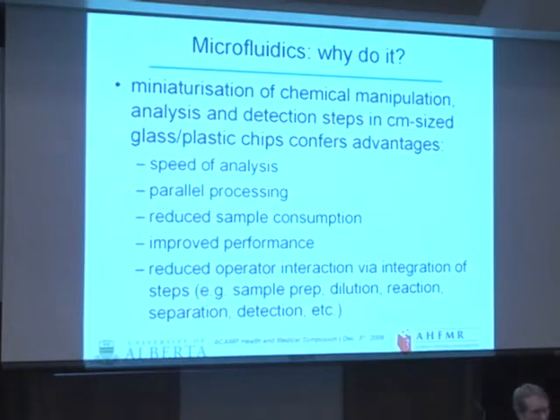The operator hopefully just pushes go at the start after they put in the drop of blood or urine or whatever the sample may be in a medical setting, and a whole bunch of operations ensue. Maybe they go and have a coffee and come back in 15 minutes and the results are ready. So that can be very attractive.